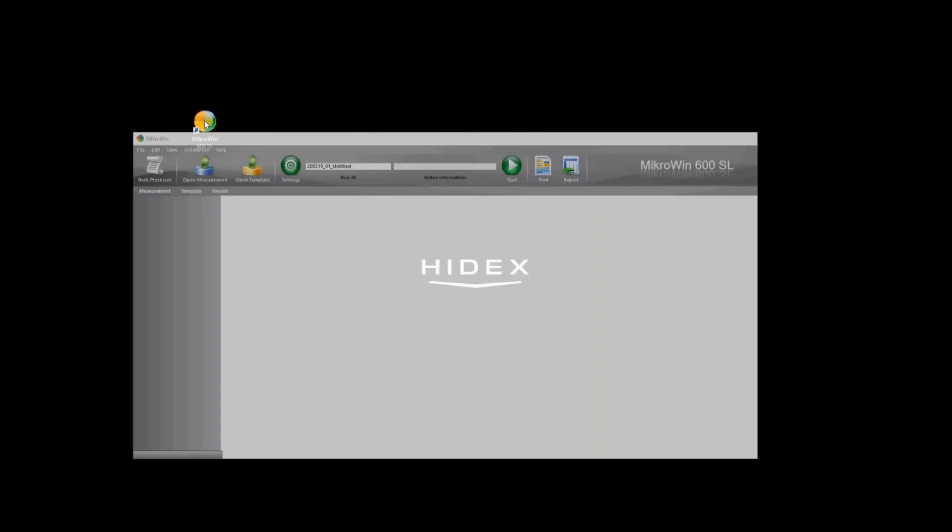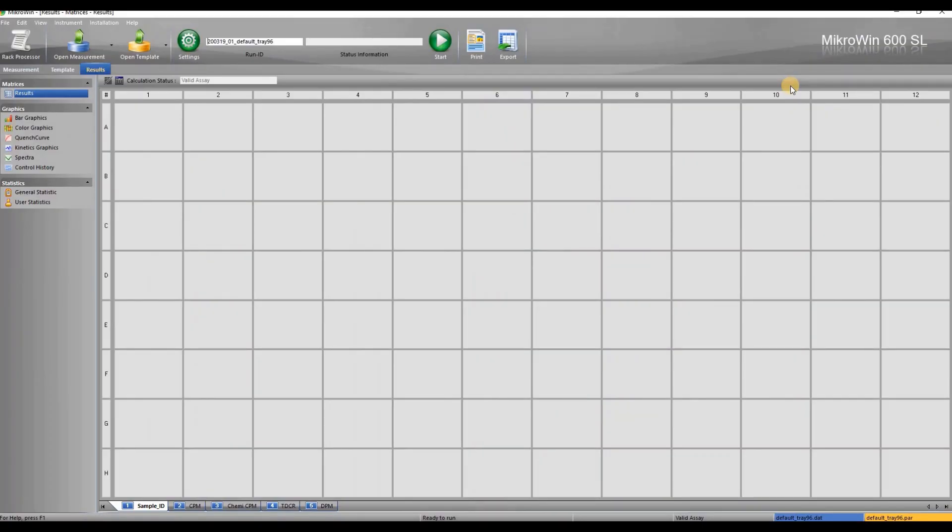We are going to start by opening the MikroWin software. This is the starting view of MikroWin software.